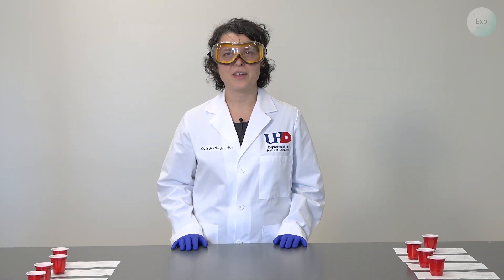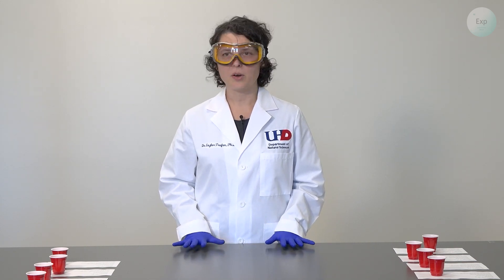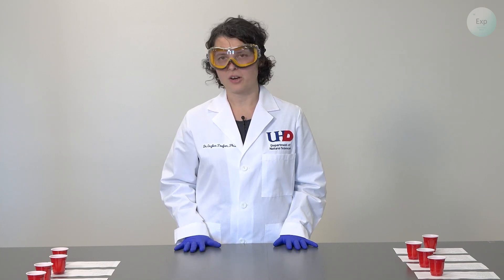Hello, my name is Dr. Esther Trufan, and in this video I'm going to demonstrate how to set up the water and vinegar mixtures for our experiment.